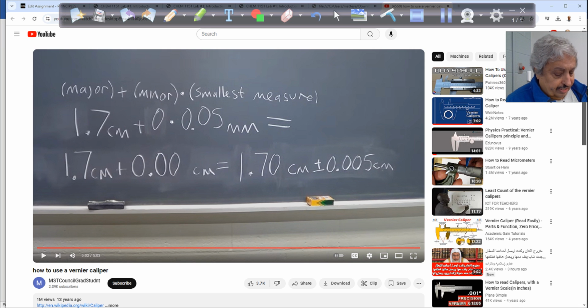The main thing is the density of those 4 balls, which we will do the Excel file for, to get the density. From where? From the Excel file by graphing. So you have 4 different masses versus 4 different diameters. The diameter is twice the radius. We are not interested in the diameters. We are interested in the radius of those spheres. Those are spheres, not circles. Circle is the area. The sphere is the volume, correct? So those are spheres, and we have to determine.